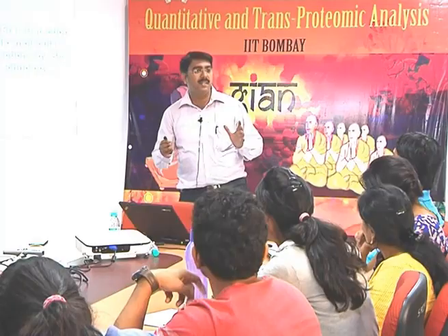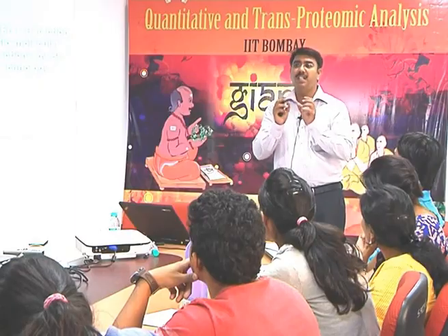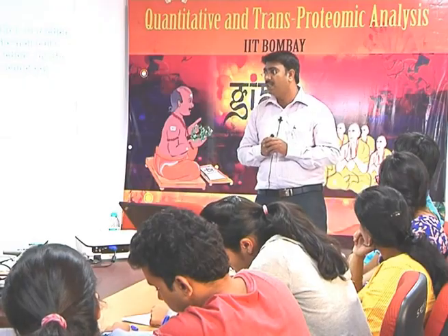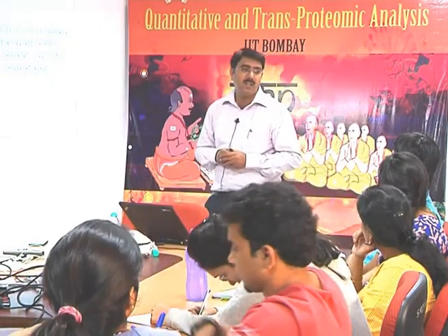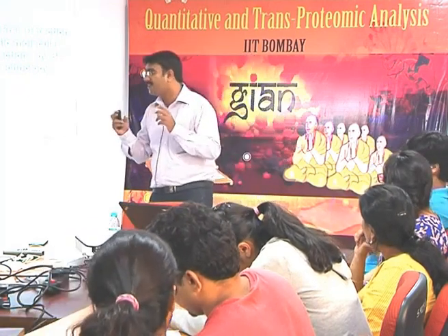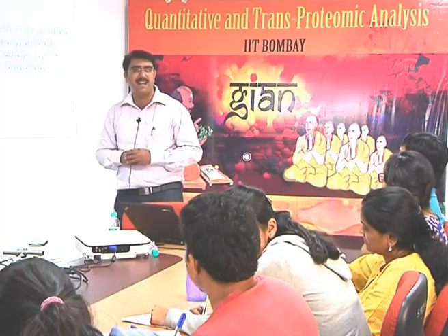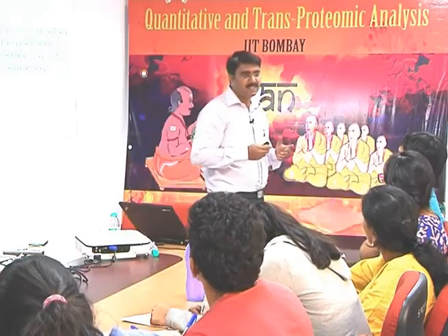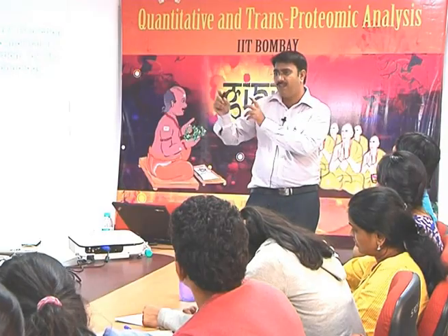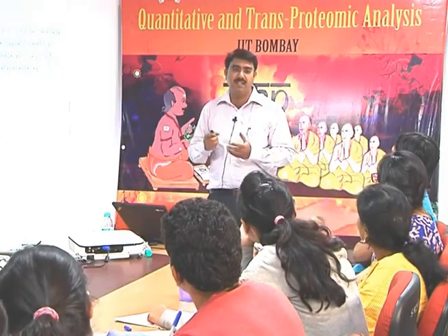Here, label-free detection comes with a different concept: solution interface and solution-solid interface. These are the two techniques. You have heard about ITC, isothermal titration calorimetry. If two proteins are interacting together, what energy is absorbed or released into the reaction system? We call this a solution interface. I think there is also a technology called NanoTemper, which is once again a solution-based, solution interface.